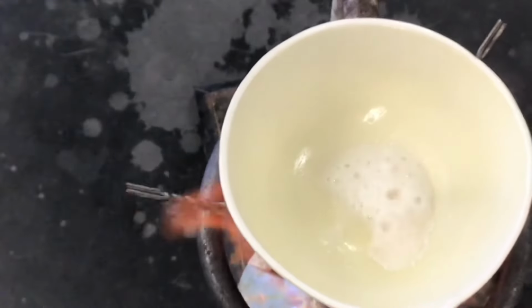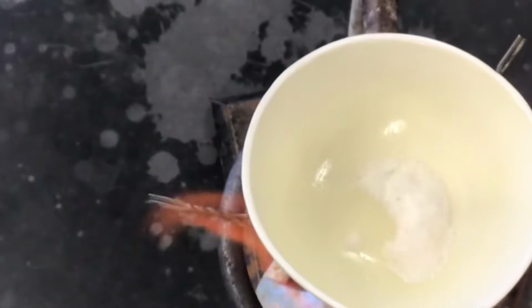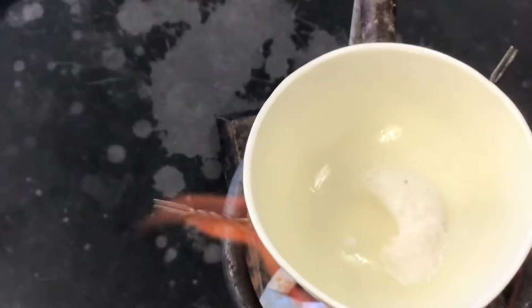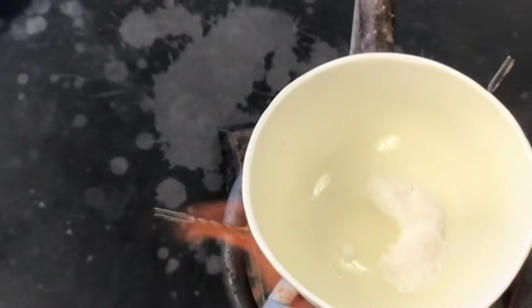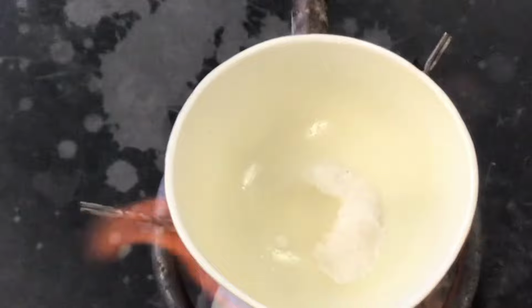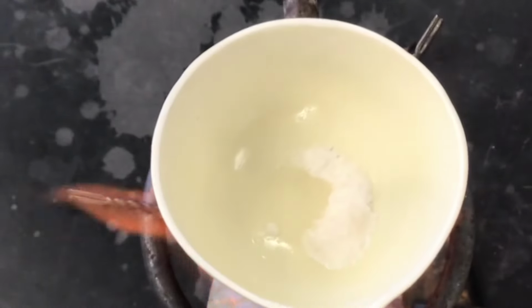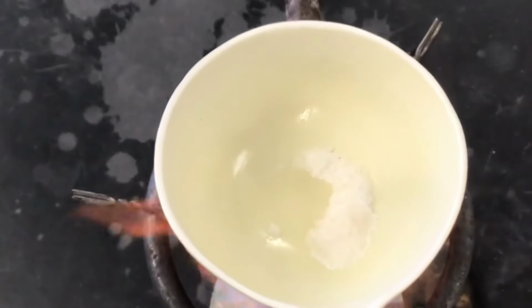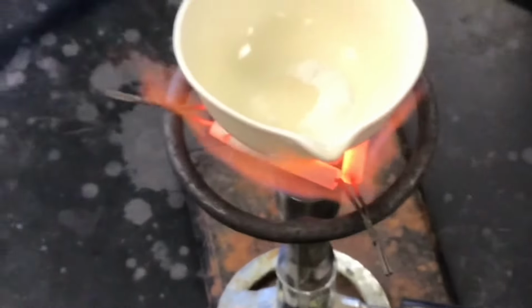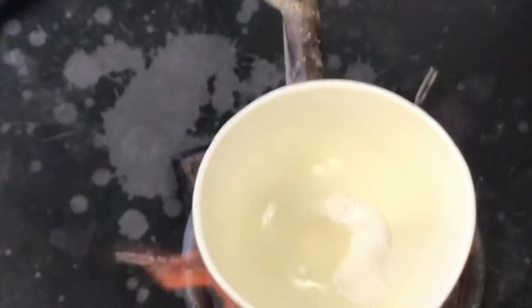Oh, I think something is happening. Yep, you can see there goes the oxygen, the last of it. That's it. Okay, ah, very nice. There we go. So it should just be potassium chloride, KCl, left after the heating.